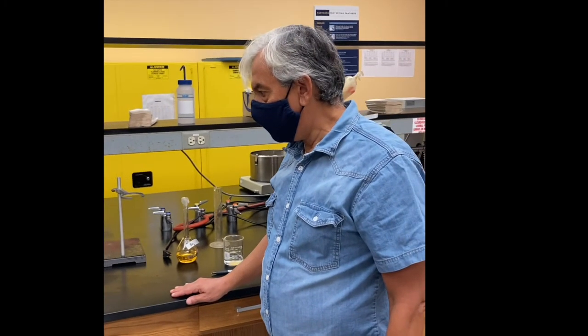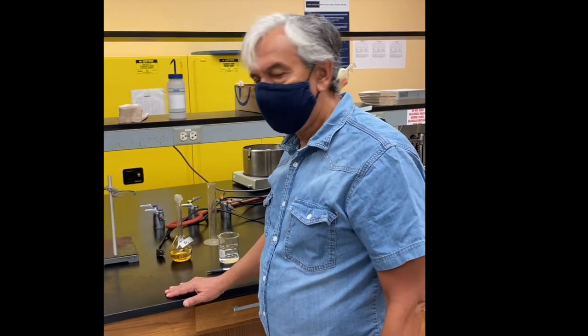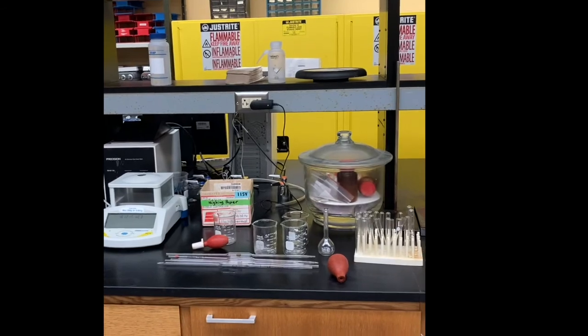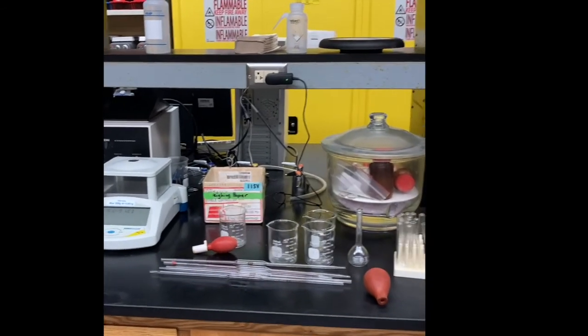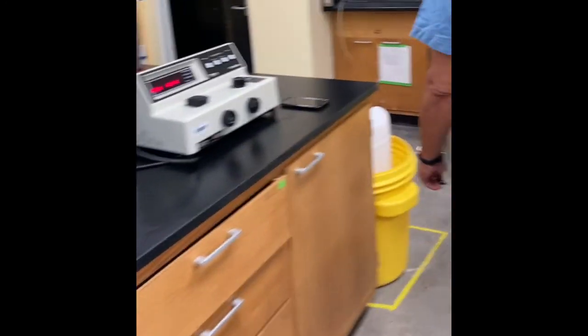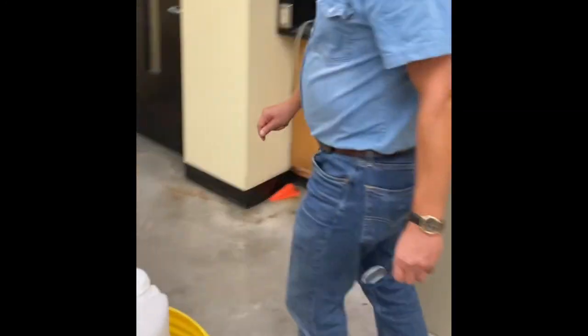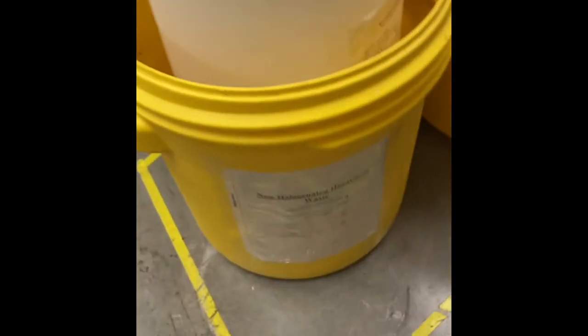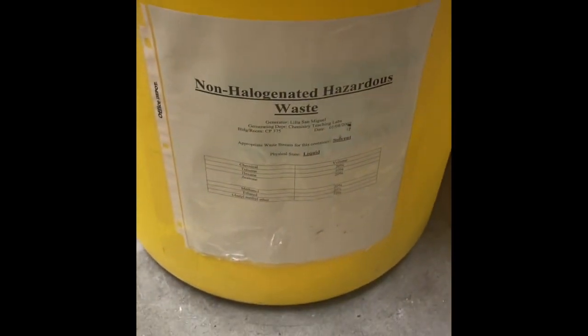After we finish our experiments for all 7 solutions, we need to clean our glassware. We need to put waste in waste containers. There are 2 waste containers in the lab. One is for non-halogenated solutions, and the second one is for halogenated solutions.